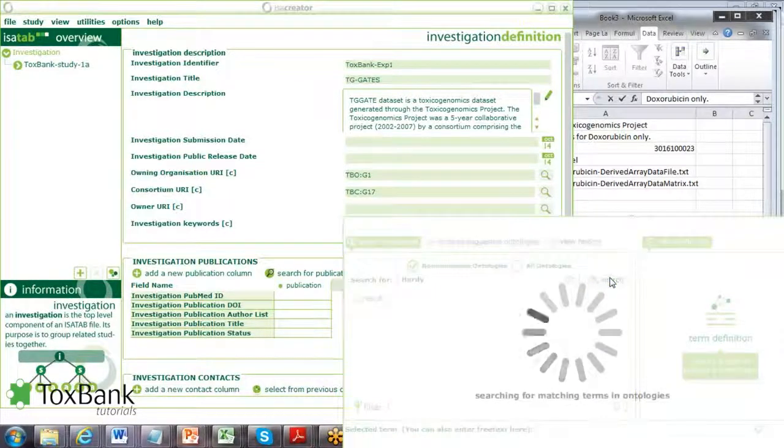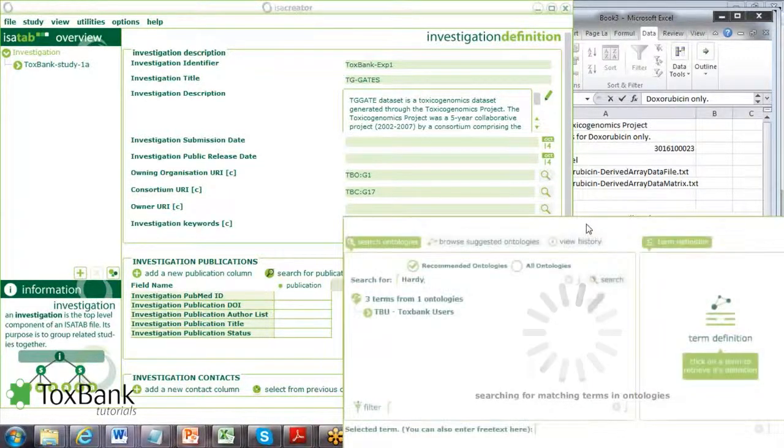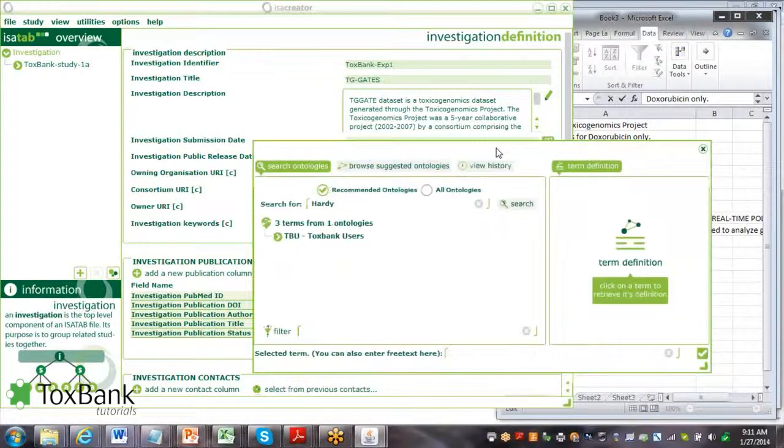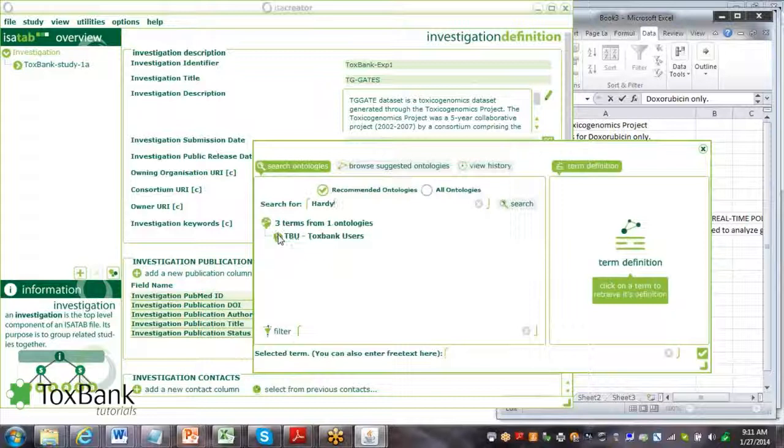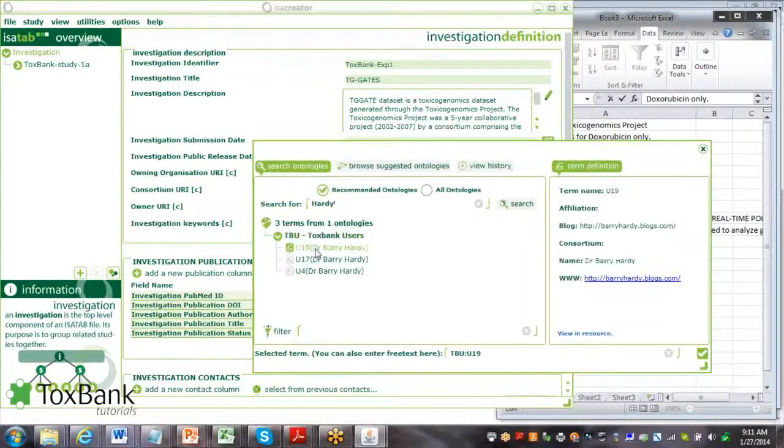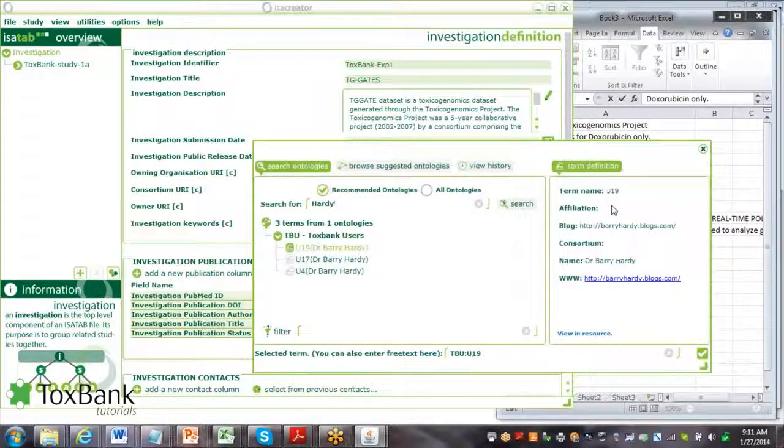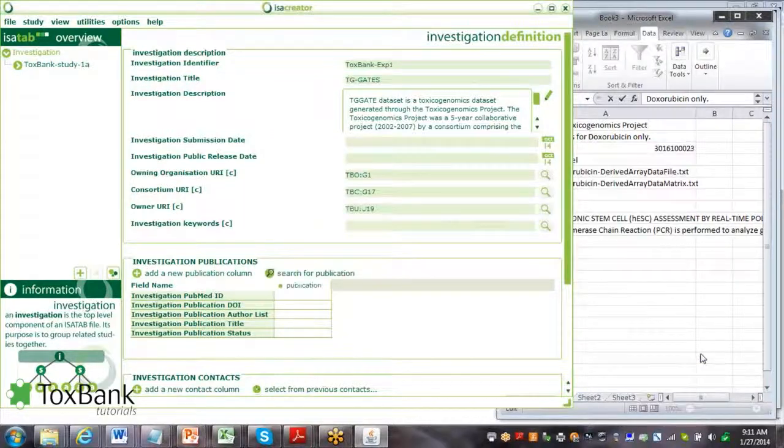Giving people access to an investigation. We identify Barry Hardy U19 and click OK.